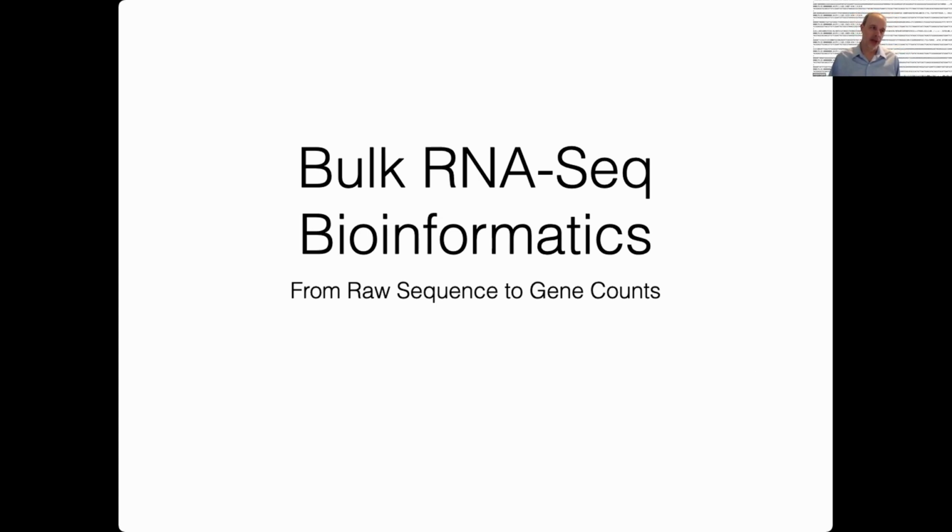Okay, so I'm here to talk about bulk RNA-seq. And I'm specifically going to be talking about the bioinformatic aspects of this. Next week, I'm going to be talking about the theory and some bioinformatics for single-cell RNA-seq. And then in 2 weeks, Dr. Shi is going to be talking about the statistical aspects of analysis for bulk RNA-seq.